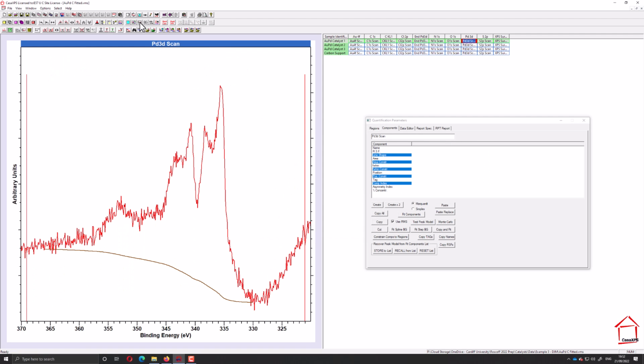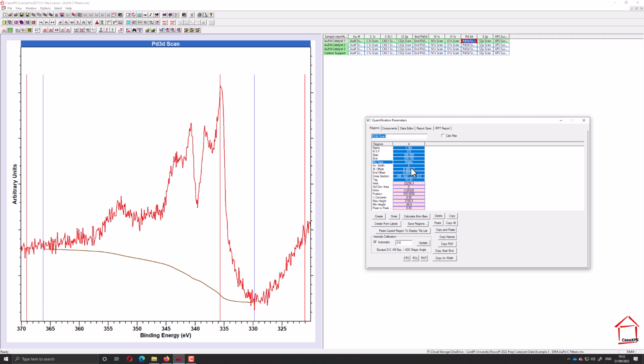Let's just turn off that residual, and we can see we have our background propagated. Just tweak it slightly, and again I'll call this the RSF 0 and I call this CBG, doesn't particularly matter, that was carbon background for this region.